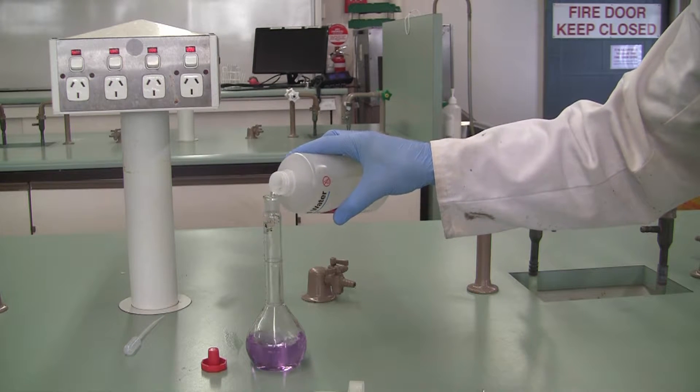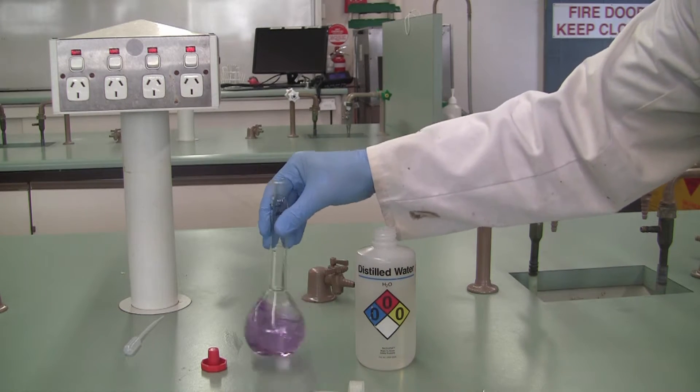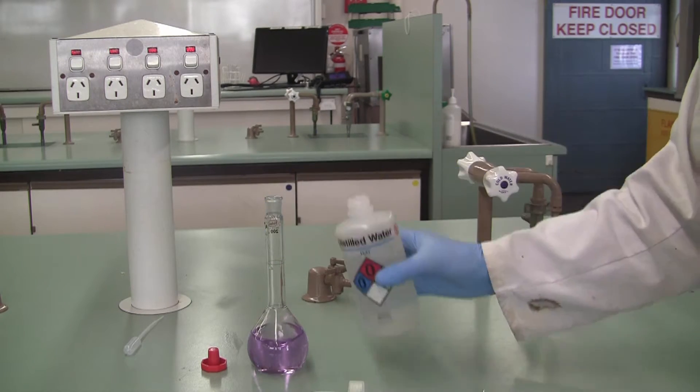Resist the temptation to put the lid on and mix that way. You'll get the liquid right up and down the flask and caught amongst the lid. Just 20 or 30 mils, give it a swirl and then add more water.